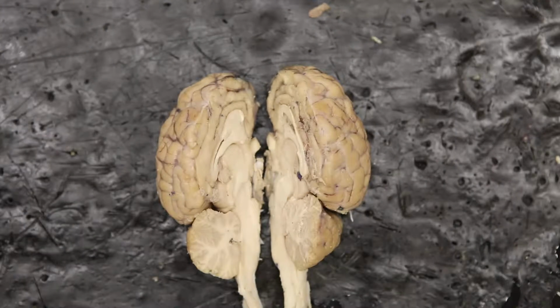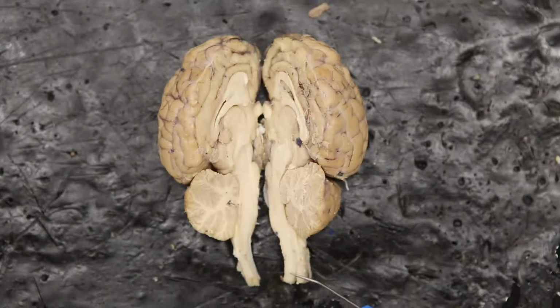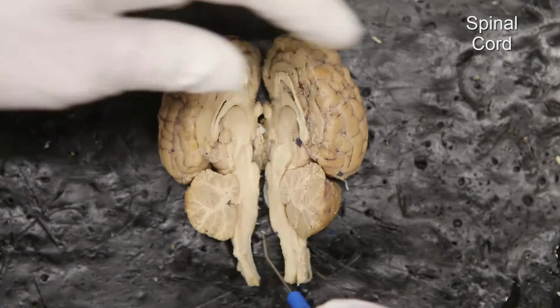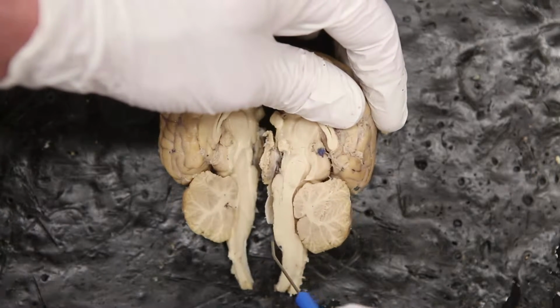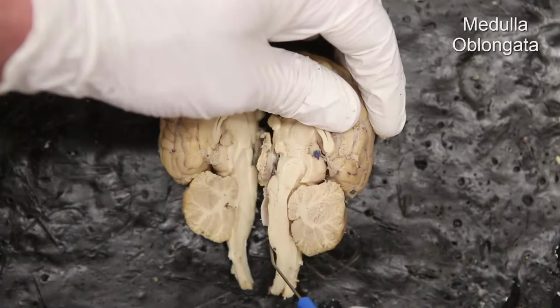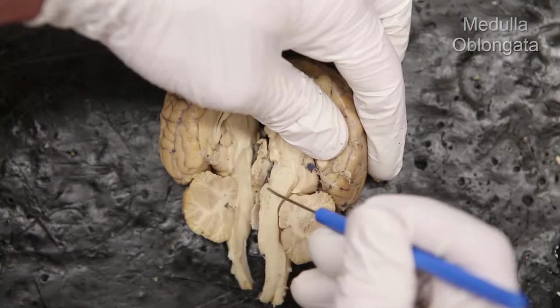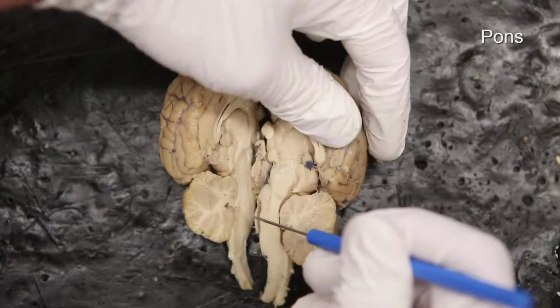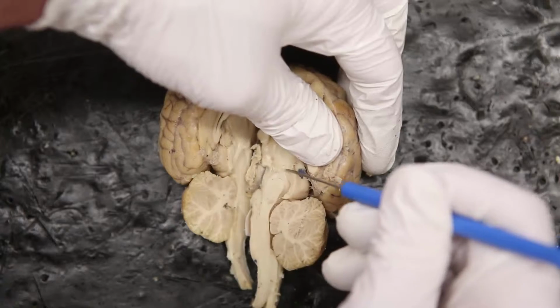So now that we go back to this view, we're going to start at the bottom here. Move this up a little bit. This right here starts off at the spinal cord. As you go up, the very first bump or protrusion here is going to be part of the brainstem. It's the medulla oblongata. From there, you go to the next protrusion right here. This is also brainstem, but this is the pons. From there you can go up. This is still brainstem, but this is now referred to as the midbrain.